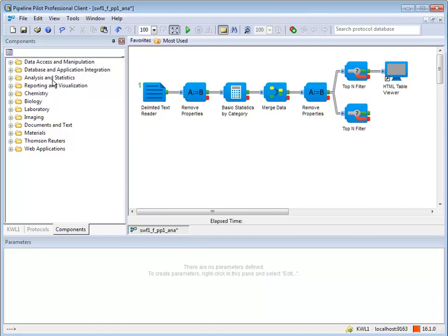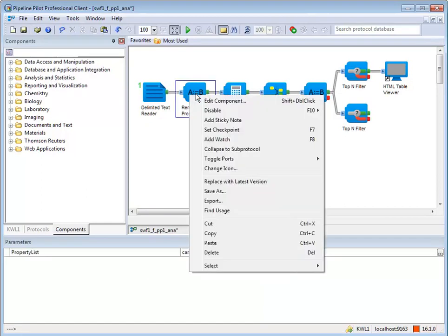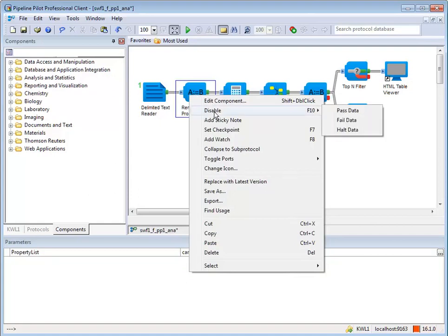There may be times when you wish to disable a component in a pipeline. Right-clicking on a component brings up the component menu. From here, you can choose Disable to access the disable options.